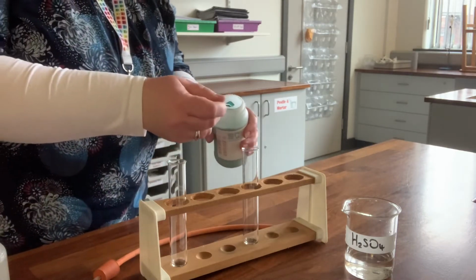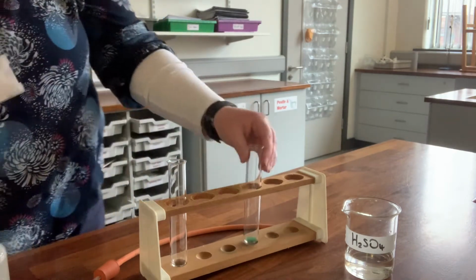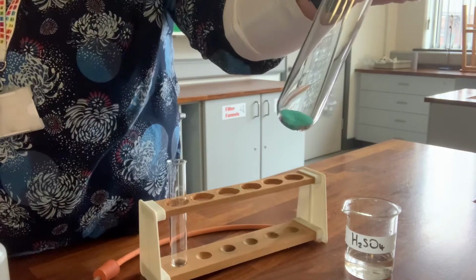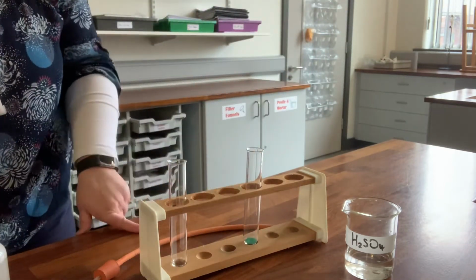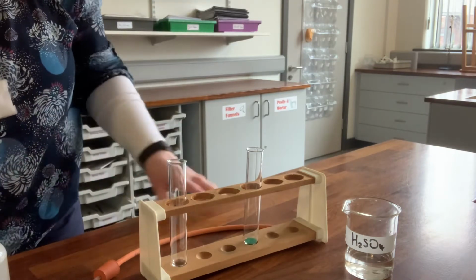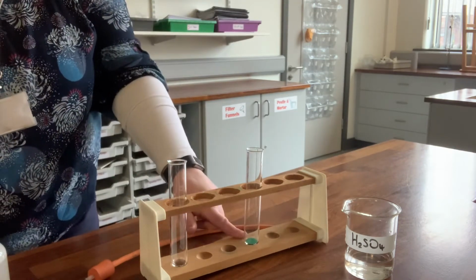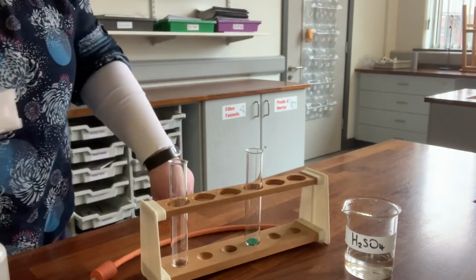So I'm going to start by putting a little bit of the copper carbonate into the bottom of the test tube. So if you can see it there, it's a nice green powder. Okay, now a carbonate plus an acid will give us a salt plus water plus carbon dioxide. So one way we can prove that this is a carbonate is that we can test the bubbles being produced to prove that the bubbles are carbon dioxide.